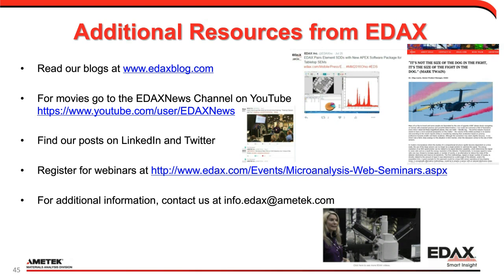I like to tell people, if you've got that Friday afternoon where you have that 2 or 3 hour block and you don't really want to do real work, so to speak, go ahead and watch our webinars. Do that continuing education, understand techniques better, understand workflow better. In the end, just make yourself a better microanalyst by understanding things.